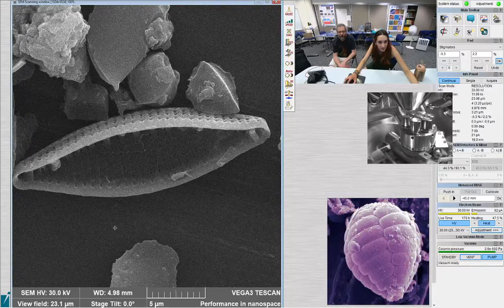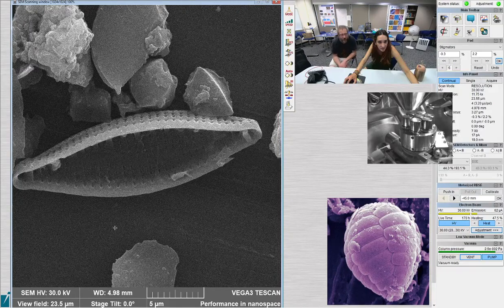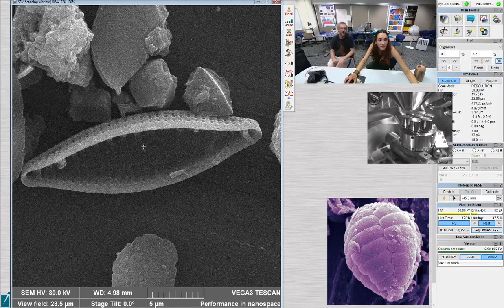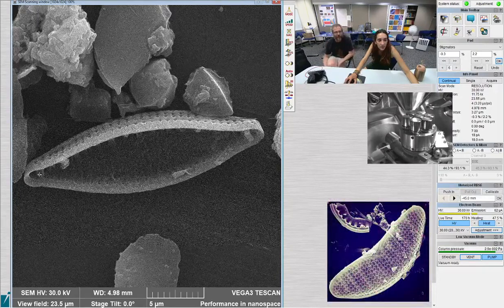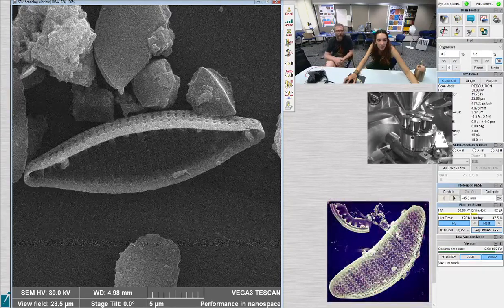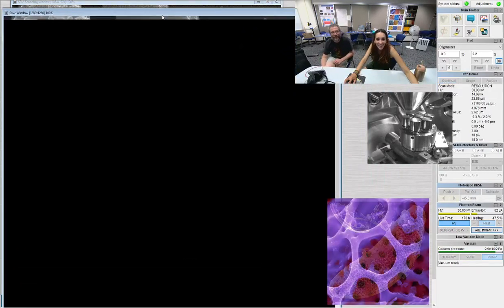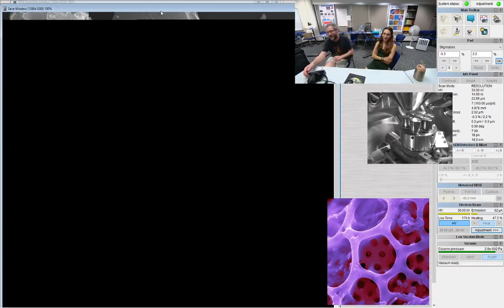Very curious. It also looks like... Oh, that's just a fibulae. Which one? Yeah, those bars coming down from the side of the fibula. Fibulae. What are they for? Or we don't know what they're for. They're like costae that haven't finished growing. Okay. Partial costae.